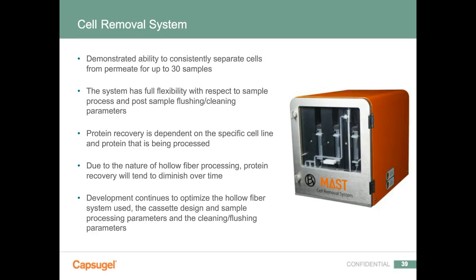Depending on your protein and your cell line, there will probably be some development associated with the exact performance you're looking at. Due to the nature of hollow fiber processing, protein recovery will tend to diminish over time. So we'll continue to develop this, and this is something that we're excited about optimizing.